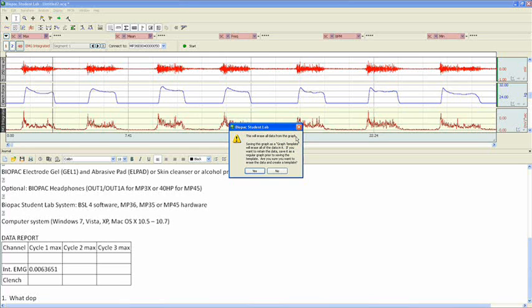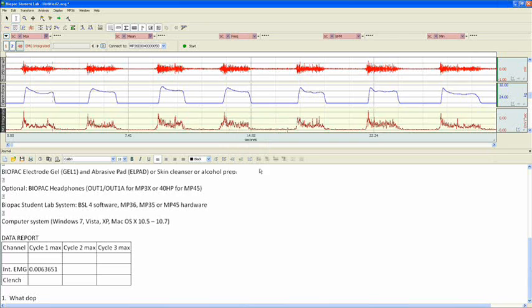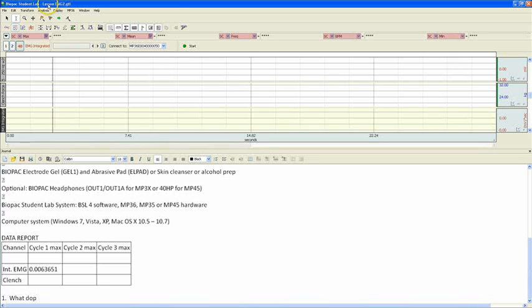Basically, what this message is telling us is that we're not saving this data. We're saving the settings. So, when the students open up this file, there will be no data displayed in the graph window. So, we click Yes. Once the lesson saves as a template, you'll see, again, as the message prompted us, that our data has disappeared. And it's now titled Lesson EMG2.GTL. Well, this is what students are going to see when they open up for Lab Day.